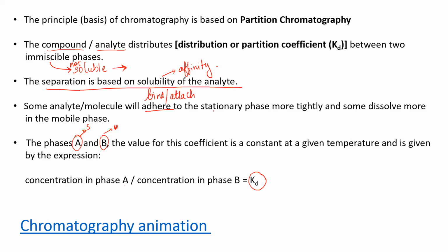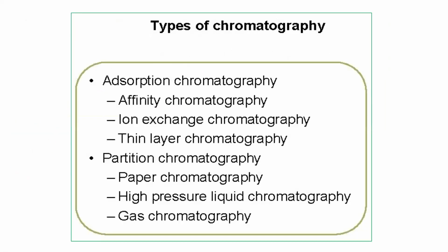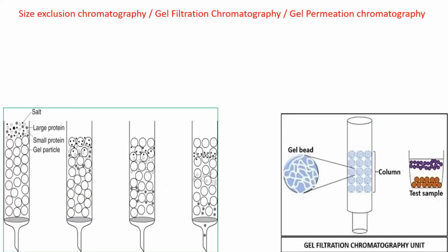Now we will first see what the working in the laboratory is, how we perform partition chromatography. Paper chromatography definitely was a liquid chromatography, but now we will also move to column chromatography, which is regularly used on a small scale and on a big scale in the laboratories to separate certain molecules, certain compounds. Okay, so today we are going to see these two types in detail.